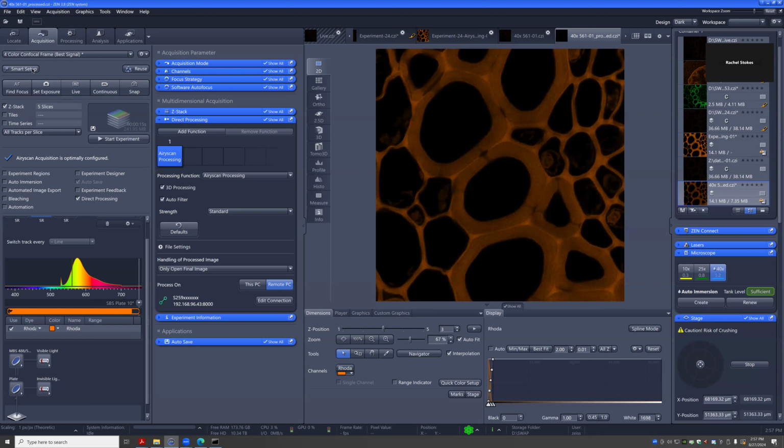It is more sensitive, so sometimes if the signal is weak, getting a little deeper can help a bit. It's not like two-photon, where you can get like 100 microns deeper. But since it is more sensitive, you might get a nicer signal from deeper within. It also depends on the wavelength and how much scattering you have. But the depth and all that is very much the same.